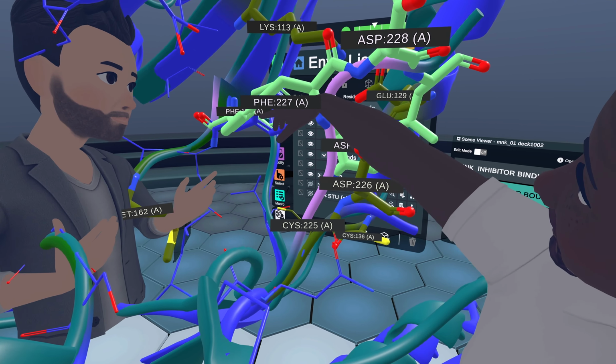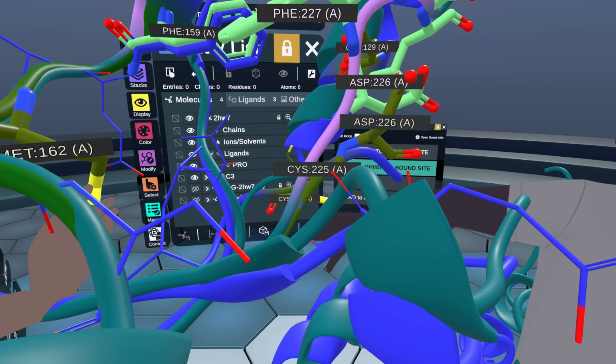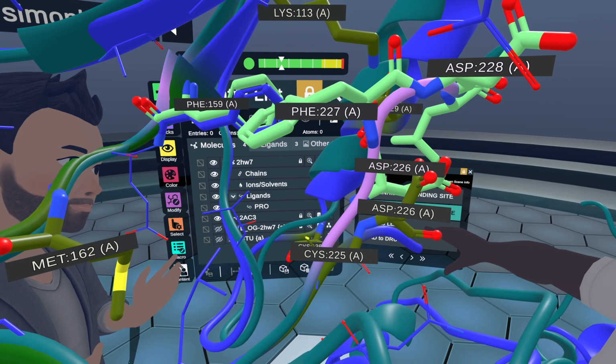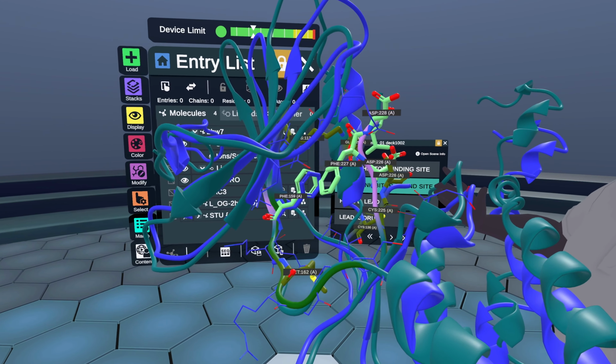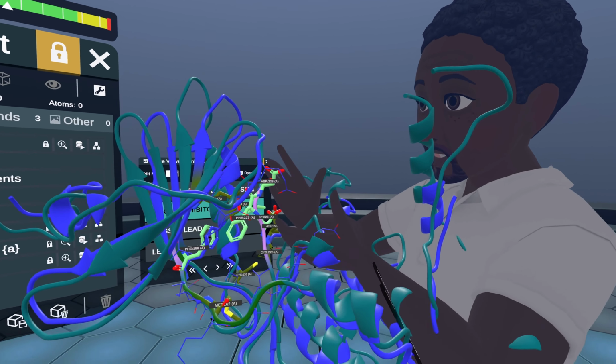Yeah, that's the DFD, with the phenylalanine in the pocket, and the loop in the inhibitor bound structure actually starts coming out of the pocket, and indeed is not even resolved because it's that flexible out here. So this is the difference between this part of the protein in the bound structure and in the apo structure. There are many other differences, but this is very key to how Mink operates.